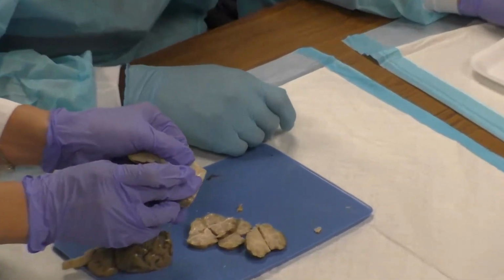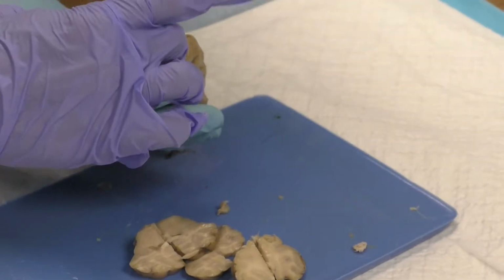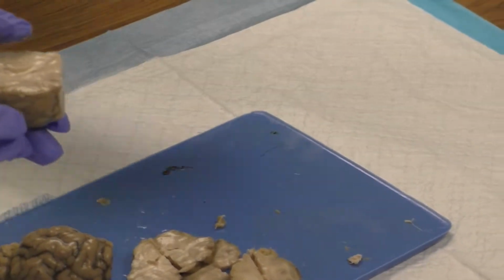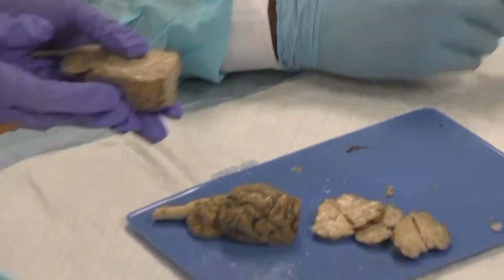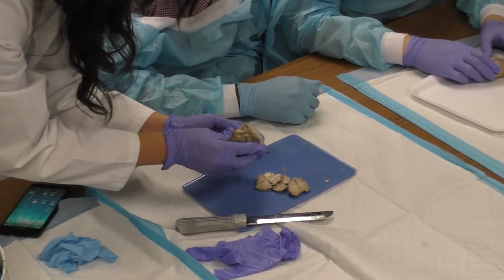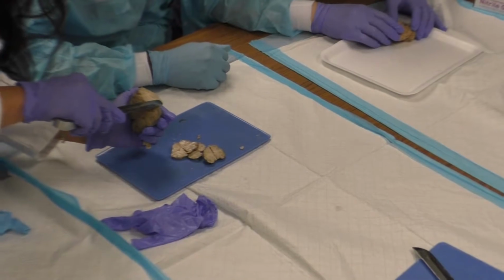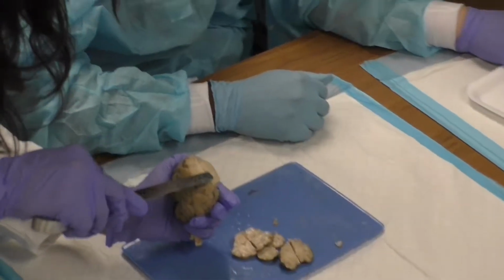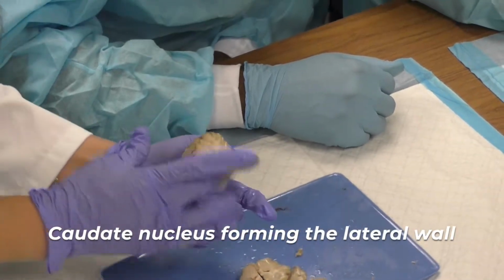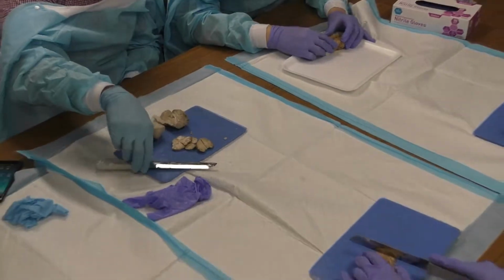and look at that first lump. Let's see. It's cutting through the first lump that we saw. See that? What was that lump? Oh, what did you call it? That lump. The caudate. Caudate nucleus. The caudate nucleus. So you can really see it beautifully. This round structure here, that's the caudate nucleus, and then you can see it's forming the lateral wall of the lateral ventricle. So cut until you can see that level.